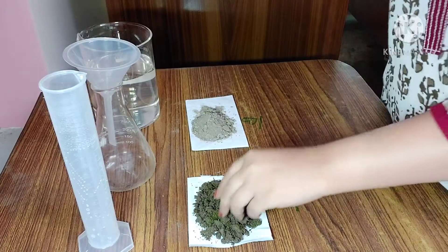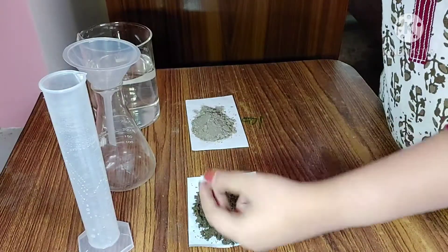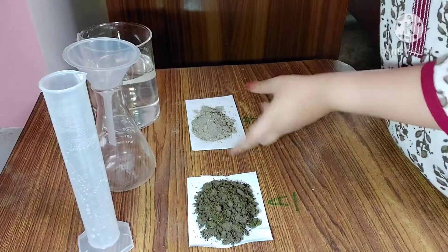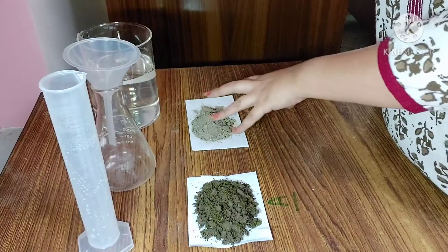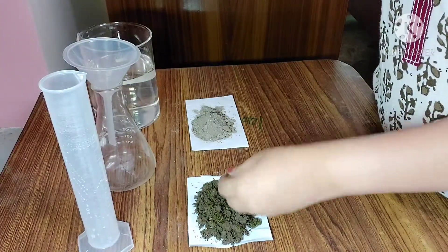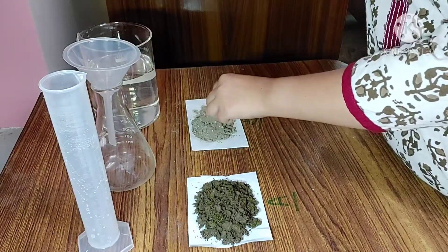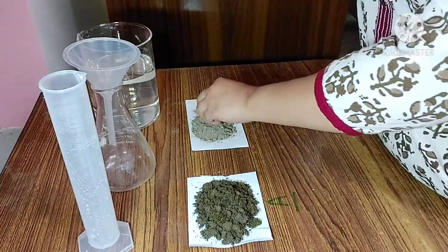From the color, we can understand that Sample A contains more amount of humus because it is a garden soil, and in garden soil humus is high — hence the dark color. Sample B is a roadside soil, so the humus amount will be low and it is whitish in color. By holding both soil types, we can also understand that Sample B is softer and more granular.